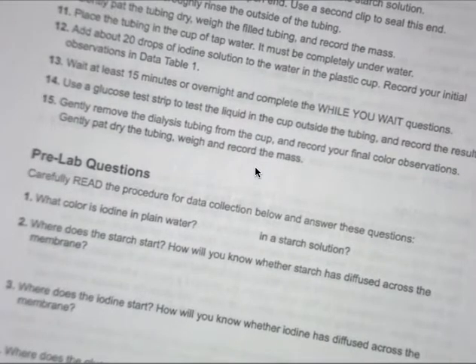Number 4, where does the glucose start? Where did you initially put glucose? How will you know whether glucose will diffuse across the membrane? So take a look at the directions. And how are we going to test if glucose is present?